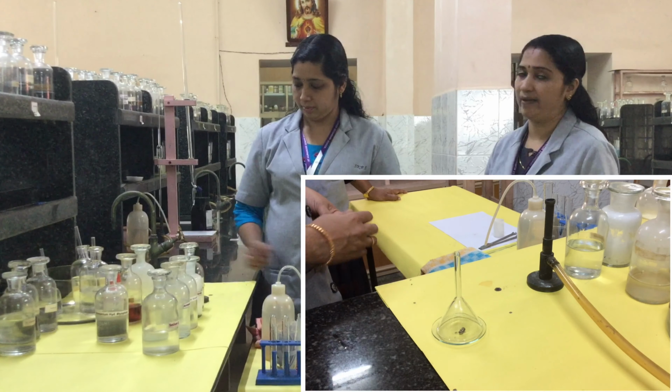So we analyzed the anions and cations present in the salt. The result is that the given salt contains nitrate as the anion and magnesium as the cation.